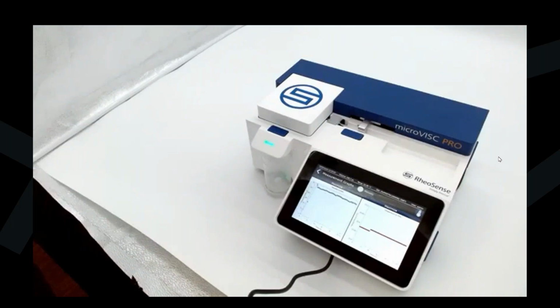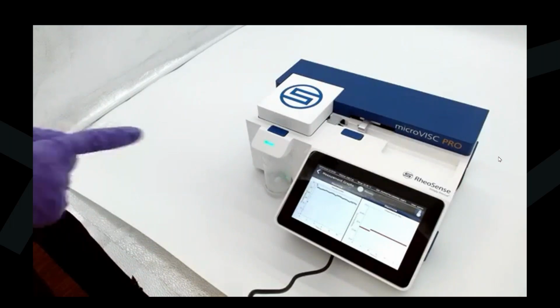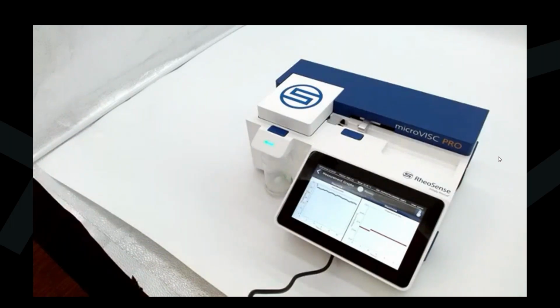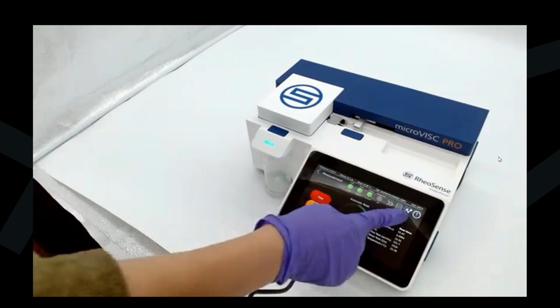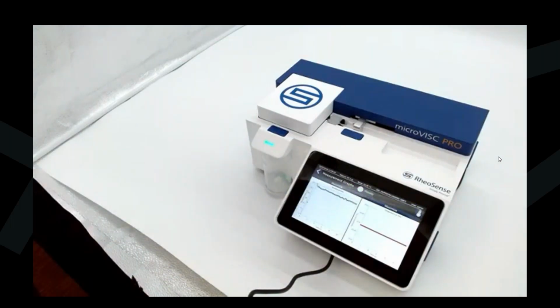Here the viscosity is around 55 centipoise, and it's measuring at a shear rate of about 1500 inverse seconds. We can see that R squared reported on the right is very good. Ideally anything above 0.99, 0.995 is excellent.